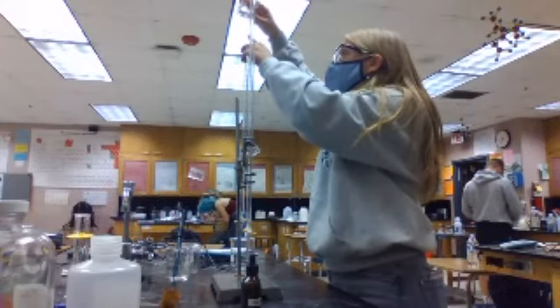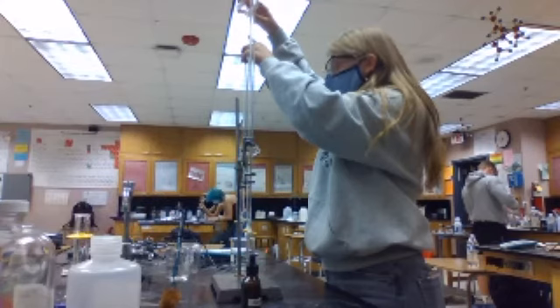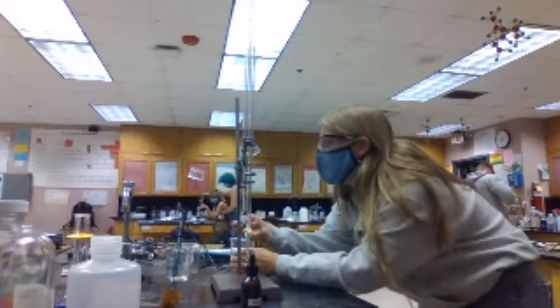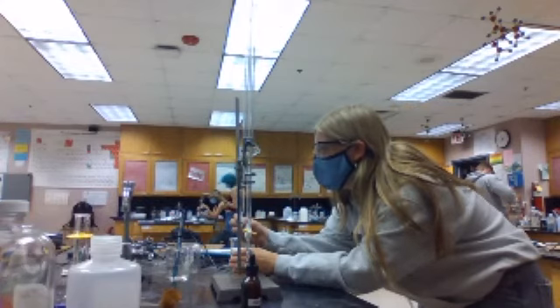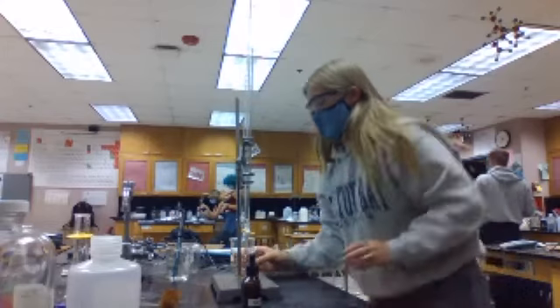That's too pink. Yeah, you want it to barely be pink. Well, it needs to set, but yeah, you just want it to barely be pink. Be careful, it jumps quick, right? Oh, too much. See? Okay, that's the acid.